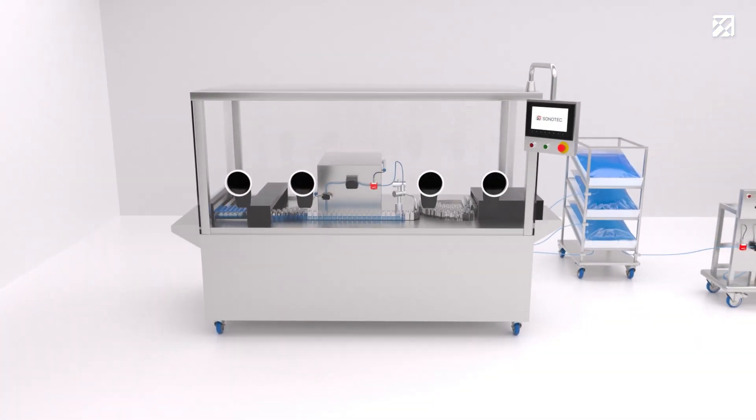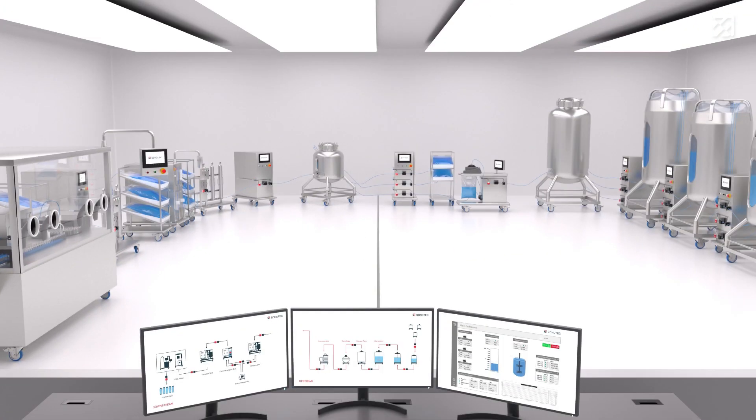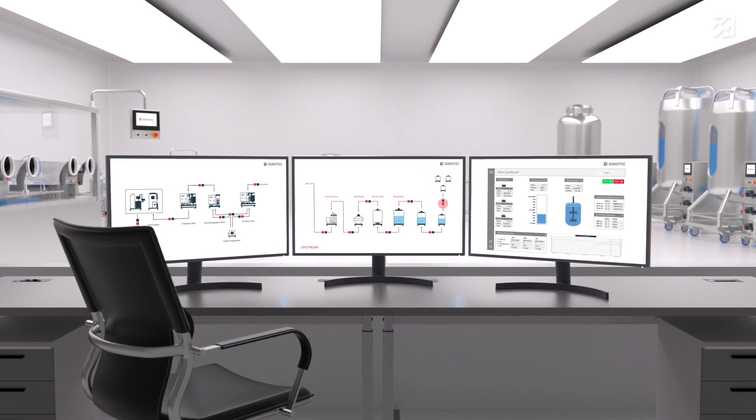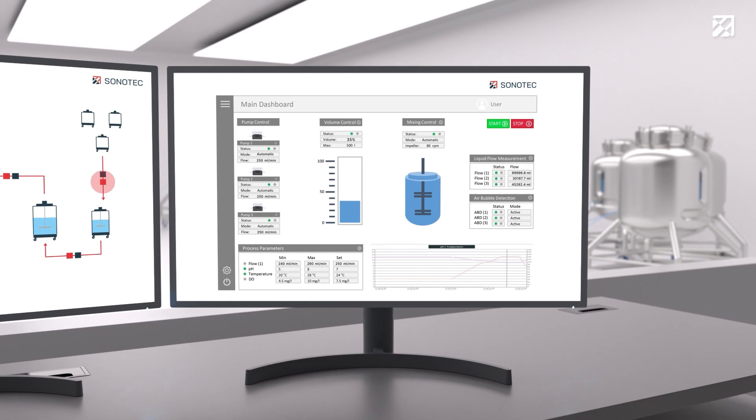Sonatec sensors continuously send measurement data to the control center. In case you have configured your Sonoflow CO55 to count the volume from a media container, it sends a signal to the control center when the maximum flow volume is reached.